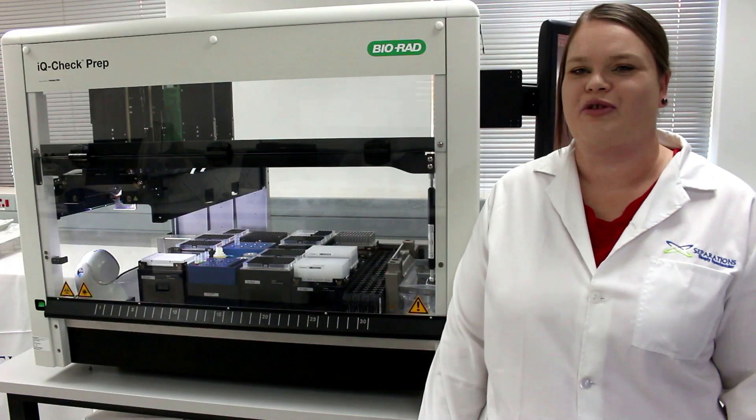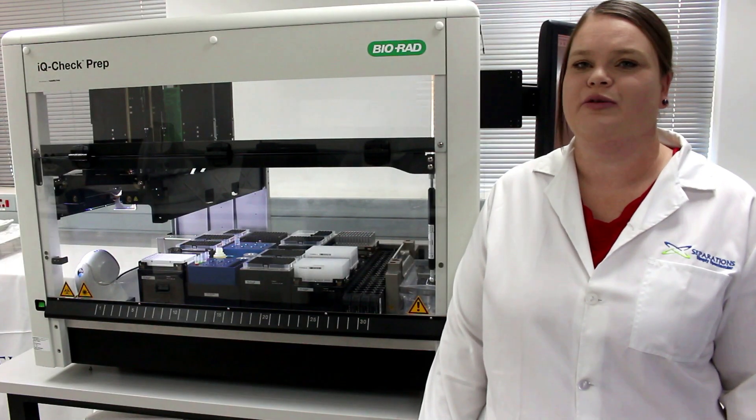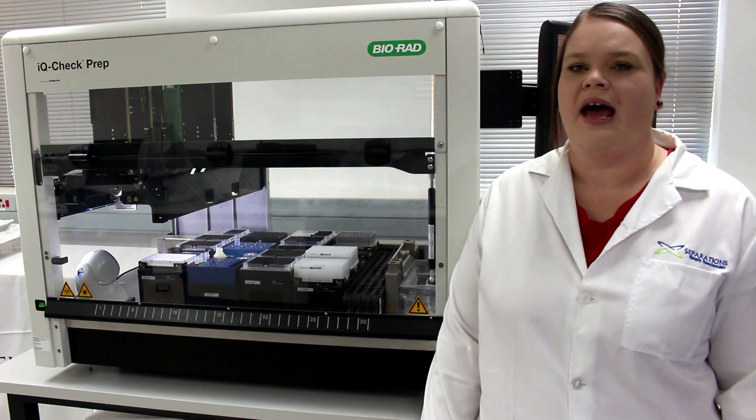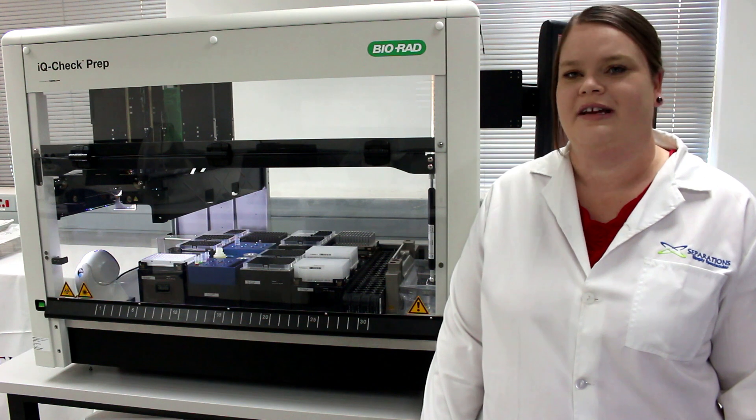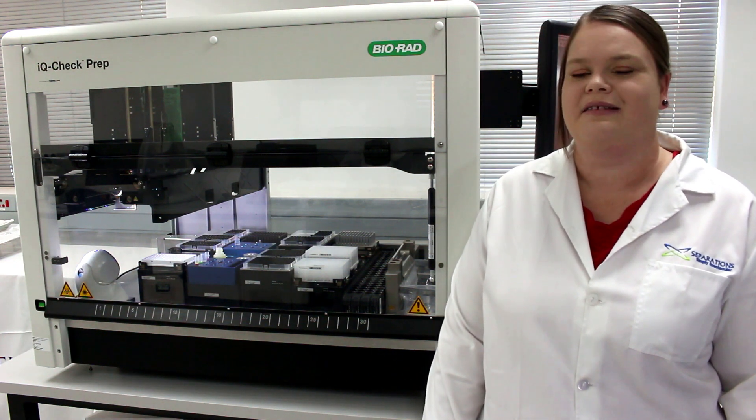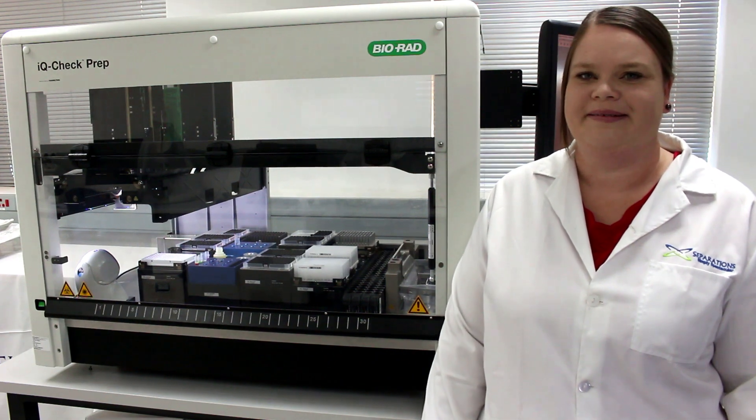As you can see, this robot is fully automated, allowing you to process a large number of samples, minimizing human error and freeing up time for analysts to do more essential tasks in the lab. If you're interested in a system like this, please reach out to Separations.